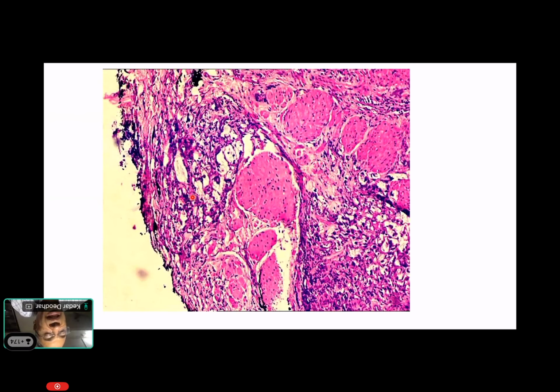So we know the T1, T2, T3, and T4 definitions. These are available in our data sets. PT3 is subserosal or mesorectum, PT2 is muscularis propria, and PT4 is either serosal involvement or serosal perforation. This is usually in the upper rectum or sigmoid colon. An example of this is the anterior aspect of the ascending colon. So this tumor is going onto the serosa, not exactly but very close to the serosal aspect.